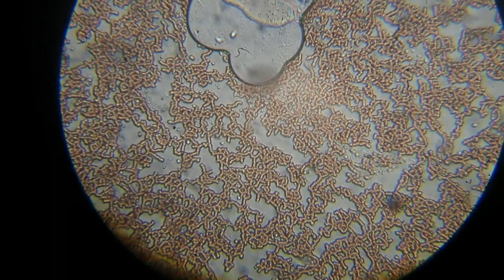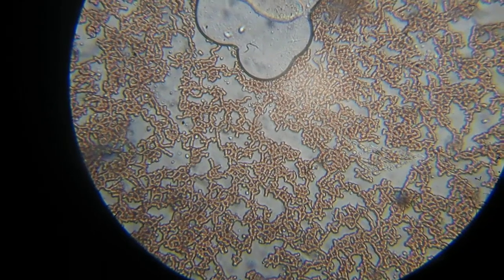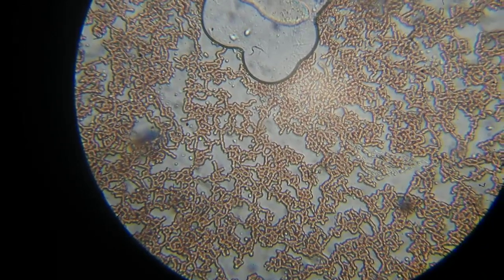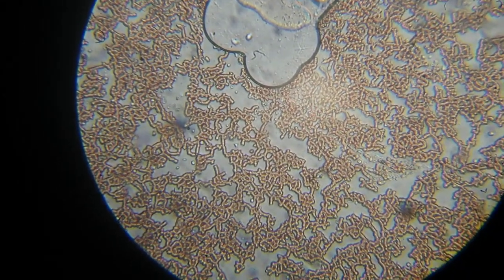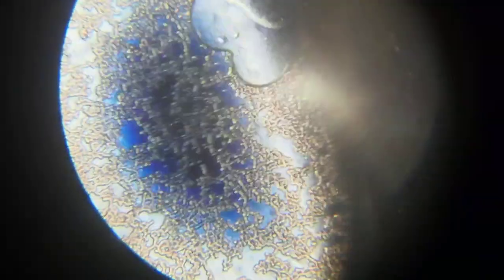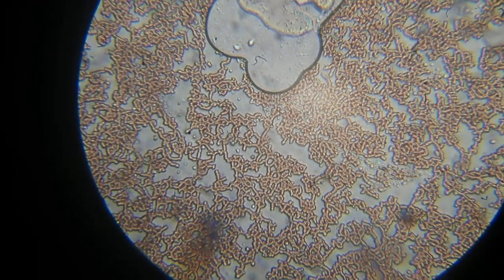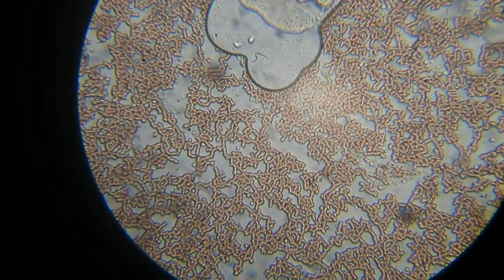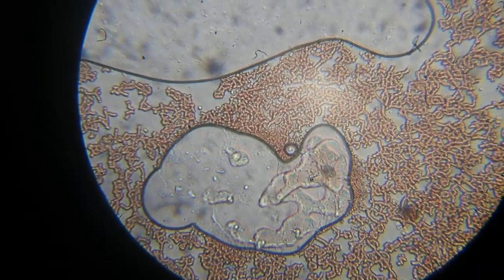But that's one of the first examples I had that things that look like something are not always what they seem. And as I mentioned before in one of my videos or my Twitter, bugs like cockroaches also apparently have some kind of fluid in their body which serves a similar purpose to blood, but chemically it is not considered blood. Even though if you look under the microscope, you see something that looks like red blood cells, but in cockroaches, apparently they are not red blood cells. So in this way I'm a little bit like a cockroach.